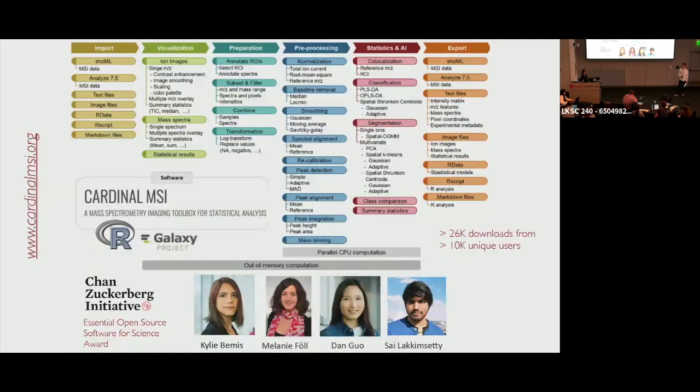And there, of course, it is important to make sure that the data is properly normalized between different runs. And that is something that I think actually needs a lot more work in the mass spectrometry imaging community. So currently, normalization mostly relies on either TIC, total ion current, or root mean squared normalization, neither of which are supervised based on any kind of internal calibrants or references. And that is something that I think the MS imaging community needs to get a little bit more comfortable with, including some internal calibrants so that there is a better normalization between different runs.